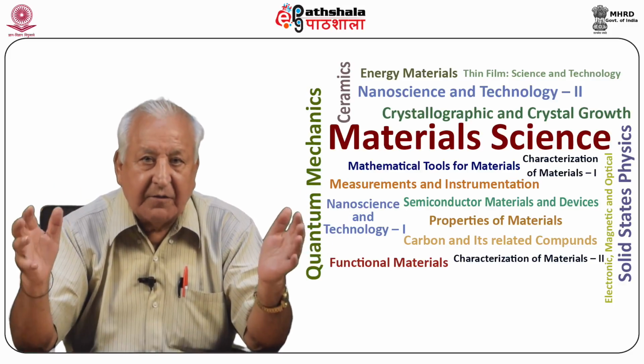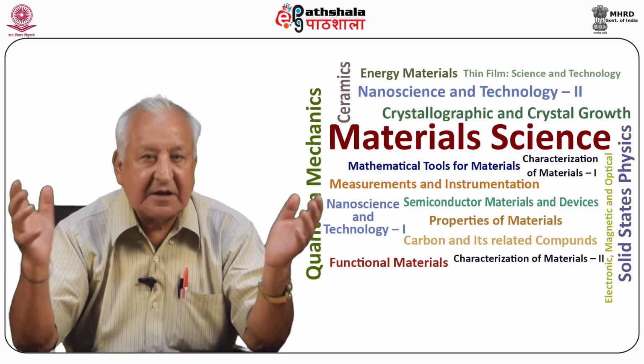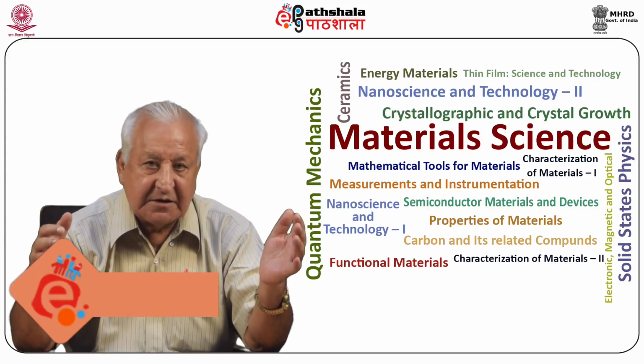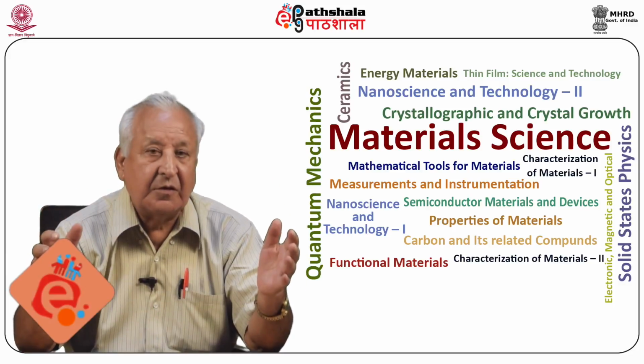Procedures involved in the measurements of Bragg angle theta and interplanar spacings in crystals are explained. The procedure of indexing of powder photographs, both for substances whose unit cell is known as well as substances whose unit cell is not known, are described.